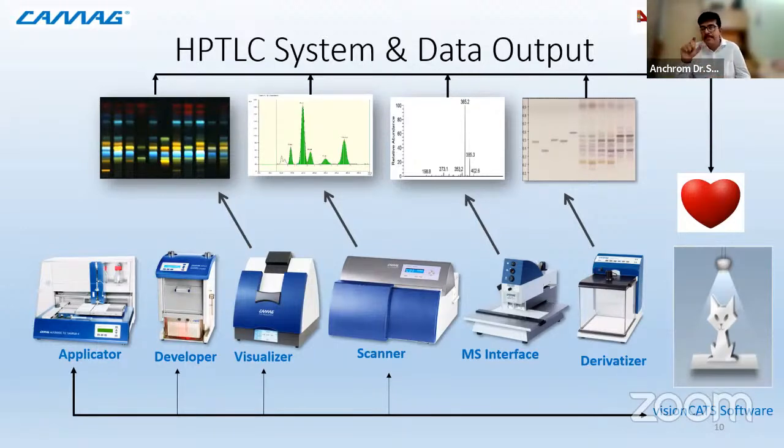Then you have the TLC MS interface, which is actually lifting the molecule from the plate, and it is a type of hyphenation. I told you, you can inject the molecule directly into an MS or collect it in a vial. Now the advantage over here is you have the least contamination. That is very important, because when you are handling a mass spectrometry instrument, which is a very sensitive detector, and you inject anything into it, it will give you something, some noise will come in. So if you are introducing a lot of contamination into it, it is bound to give you a lot of peaks, and you will never understand what is there.